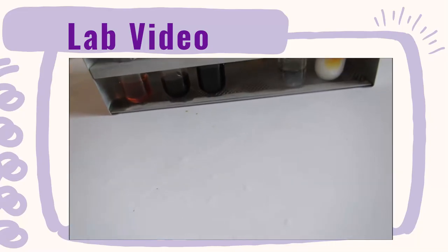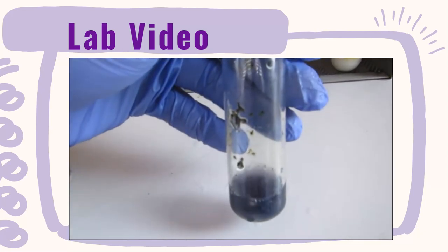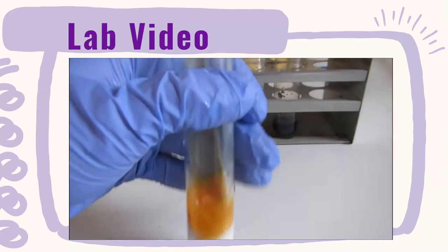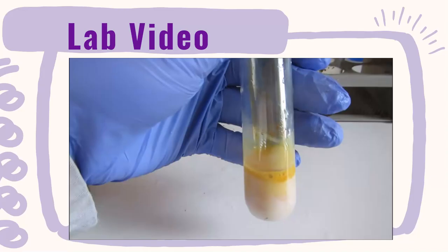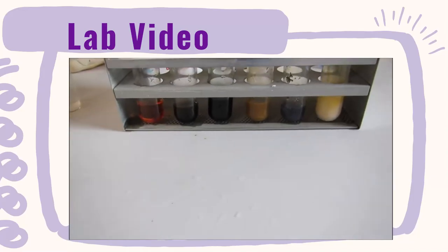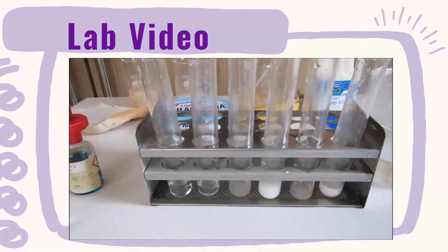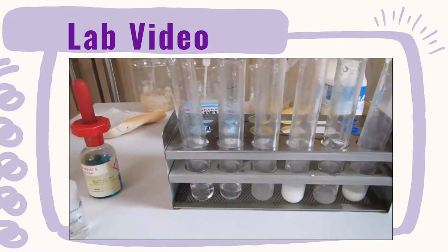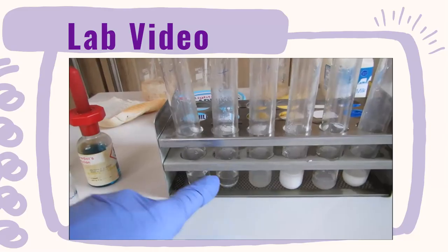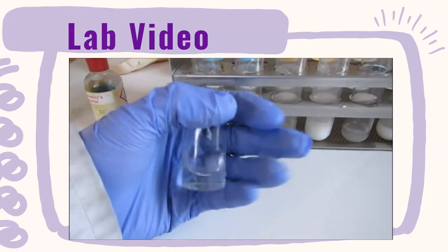So for our bread, do you think it contains starch or not? And our cheese spread, again, do you think it contains starch or not? In our banana, do you think it contains starch or not? And finally, in our milk, do you think it contains starch or not?